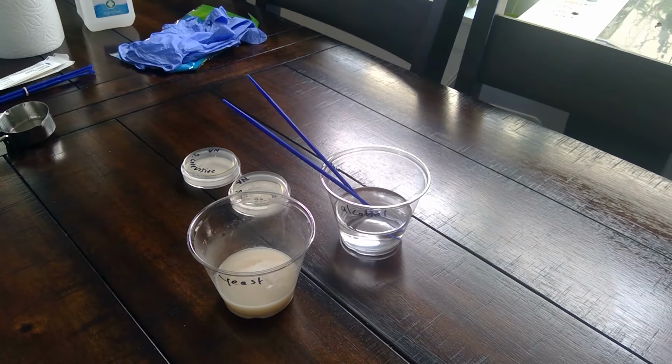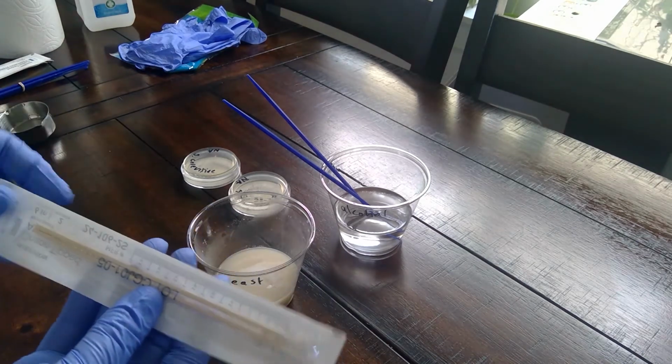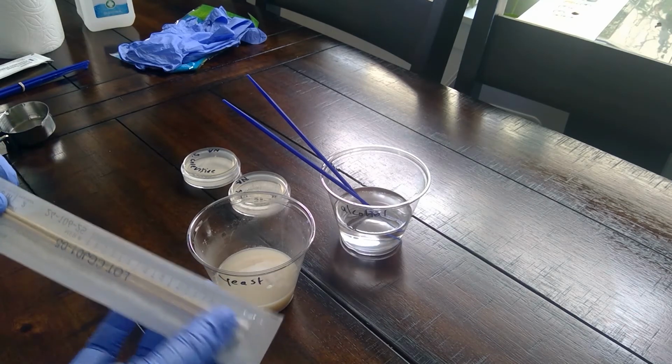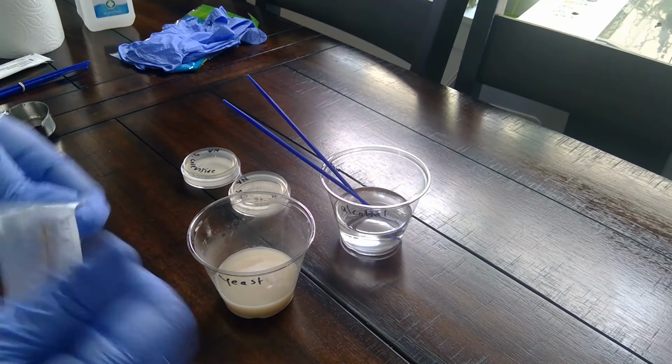So now we are on step 11. Carefully remove 1 sterile swab from the packet and submerge the tip of the swab in the yeast mixture until saturated. So we'll just grab one of these sterile swabs. Each one has 2 in it. You'll want to open it on the side that the handle is, to keep these sterile. And just remove 1.